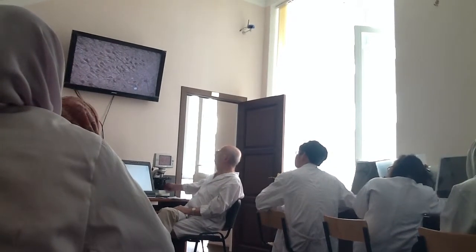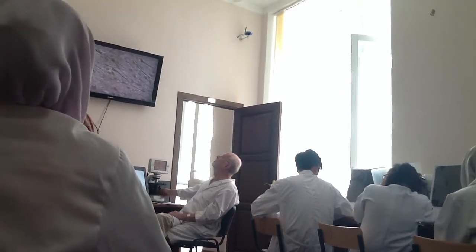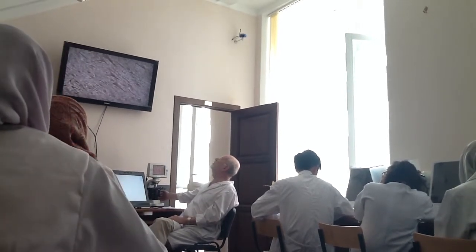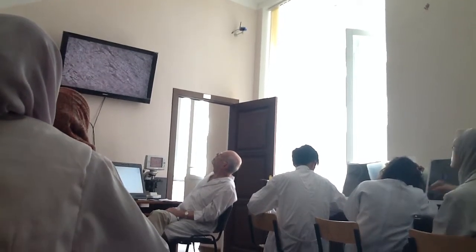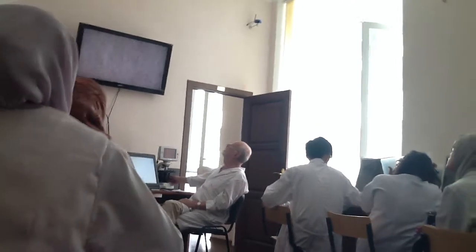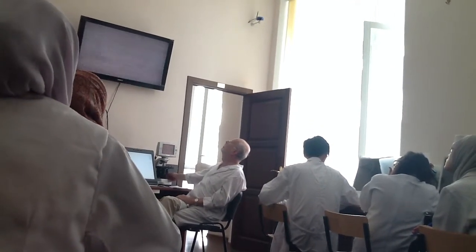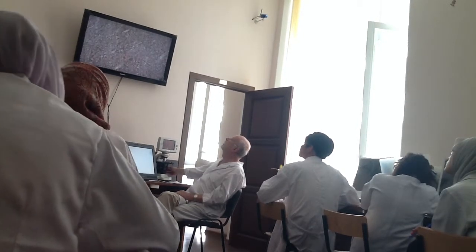Pyramidal neurons, see? Neurons are pyramidal in shape, pyramidal, then pyramidal, and at last, where?